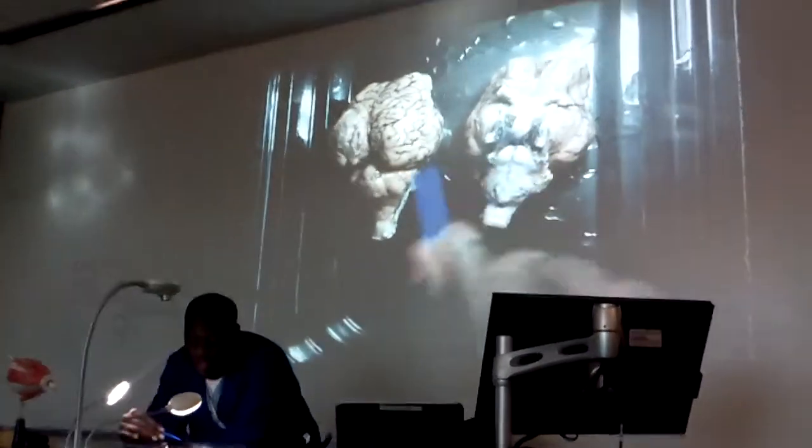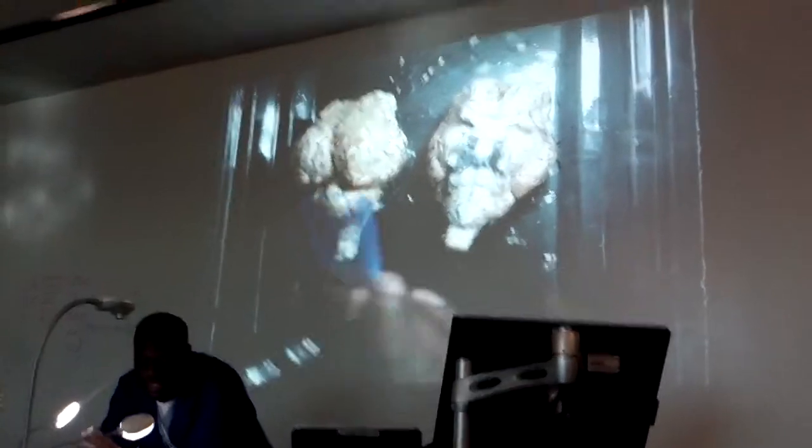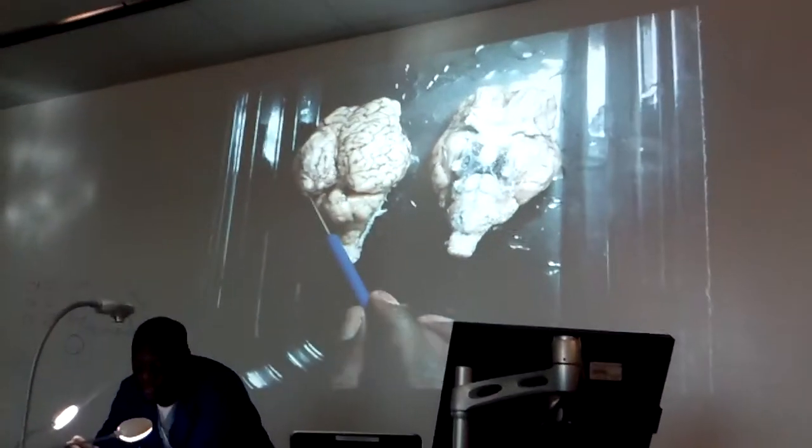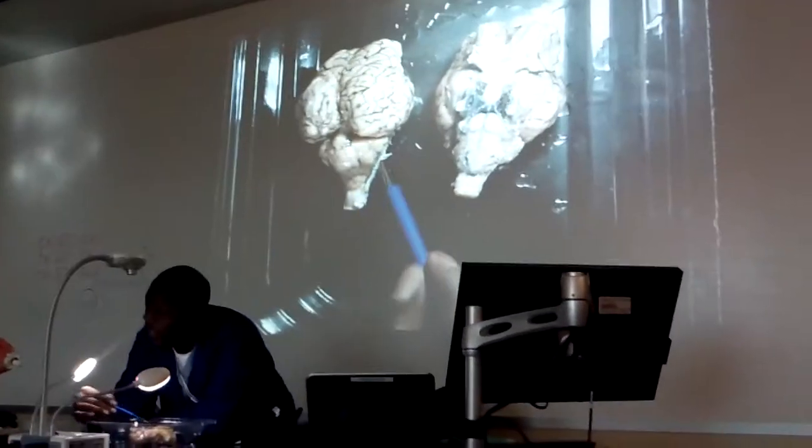That makes sense. Now it talks about 4 lobes. Let's look at the 4 lobes. Make it easy. Here are our 4 lobes. The part on the front is called the frontal lobe. The part right here on the side is called the temporal lobe. The part that you see right here is called the parietal lobe. Then you see this part on the back where vision originates, that's called the occipital lobe.